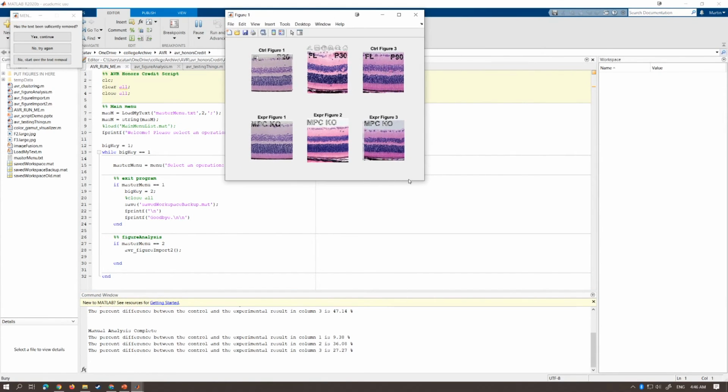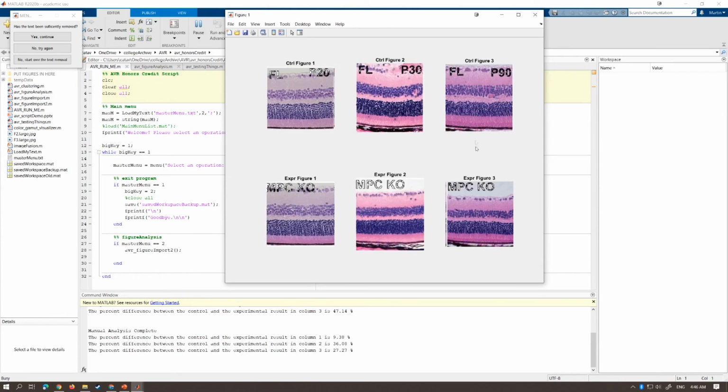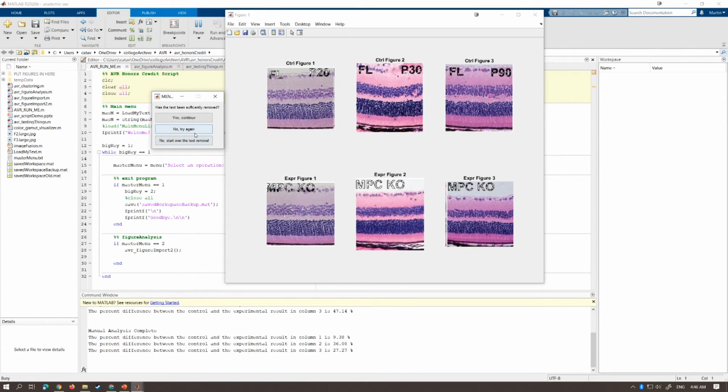Now, you're going to notice initially it identifies some parts of it, and it's trying to erase it. But the threshold is a little too low initially. And I demonstrate this because you can actually try it again and determine your own threshold that you'd like to try. So right now it is set to black, and this is from a scale of 0 to 255, going from the blackest to whitest. And so since we're trying to filter out the black text here, let's go ahead and knob this up to, let's do 20.